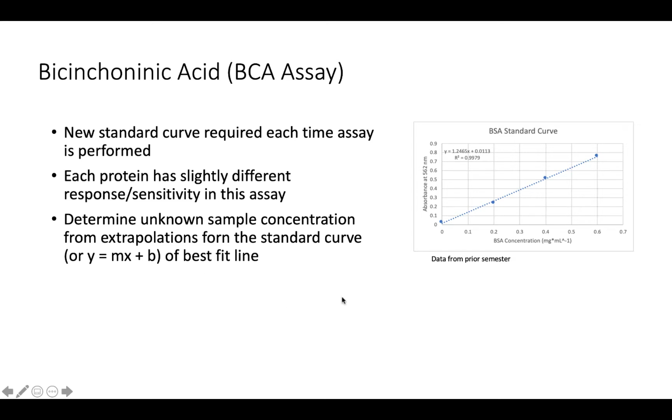So this should look fairly familiar to you. We've used this Beer's law type assay in most of our Gen Chem that we've done. I know I'm teaching Chem 251 right now. We're using and creating a Beer's law type calibration curve this week also. So good Beer's law week for me. So that's the end of my background that you need for this lab period.